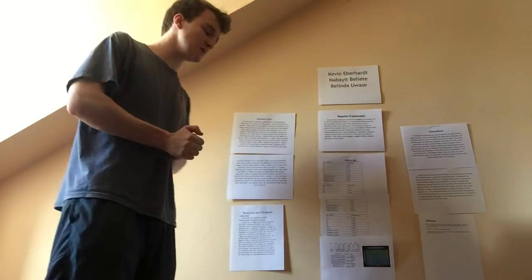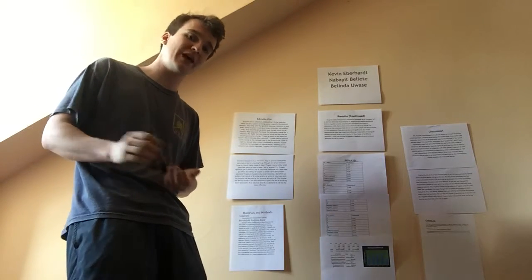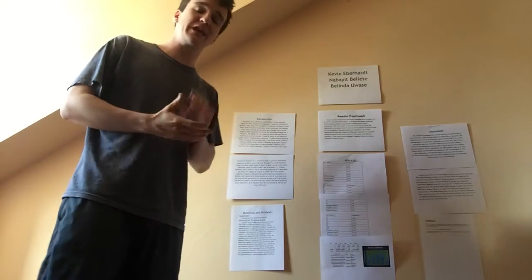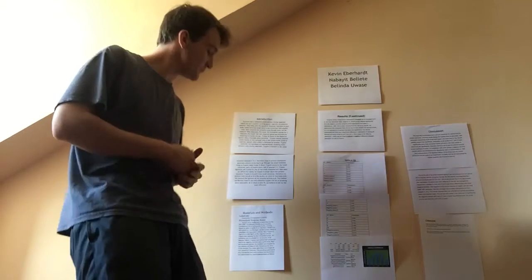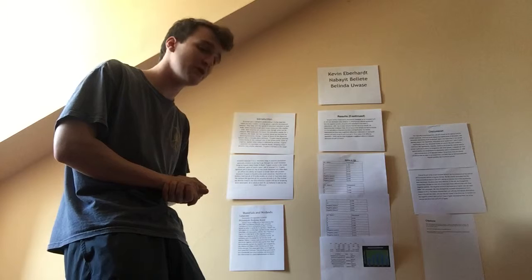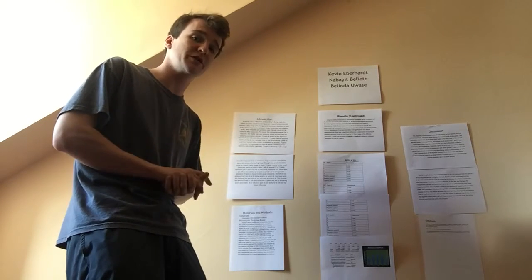So in order to do this experiment, we used a substrate of azocasein. As I mentioned before, casein is a milk protein, and so we have added this azo dye with sulfonamide. Sulfonamide is added to the casein dye in order for us to better be able to read our results. So it forms this azocasein. And so that dye is absorbed at 440 nanometers in a spectrophotometer, so that afterwards we can see how much of this protein has been broken down by measuring absorbance.